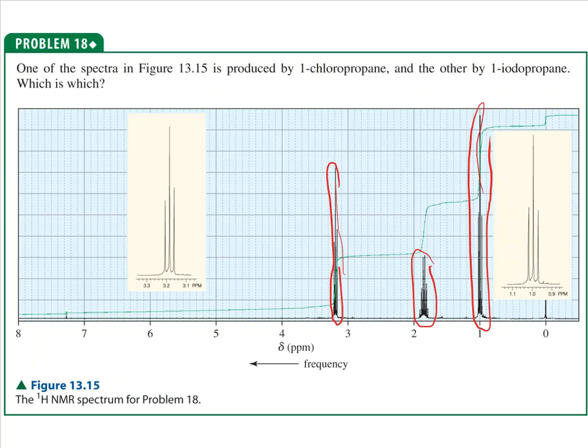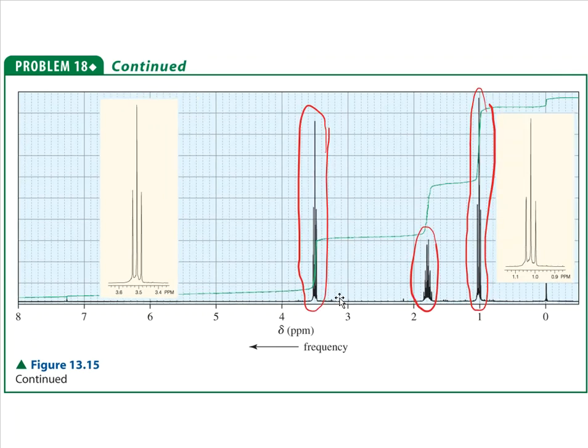But if this is a comparison, and that's all that they want me to do, is just compare these 2 NMR spectras to each other, then I'm going to use that as a judgment call. And it looks like in this second NMR that has the higher signal in the 3 to 4 range, well, this maybe, just maybe, might be the chlorine, because chlorine's more electronegative.